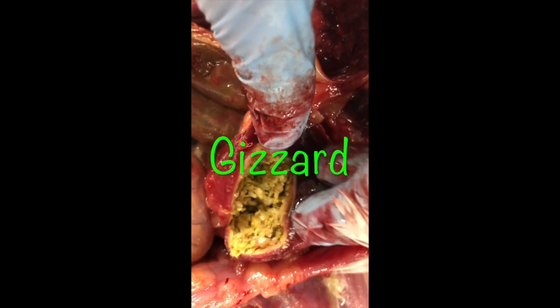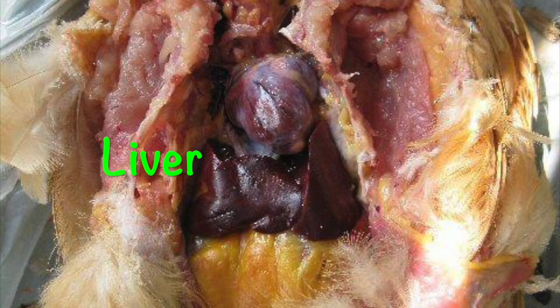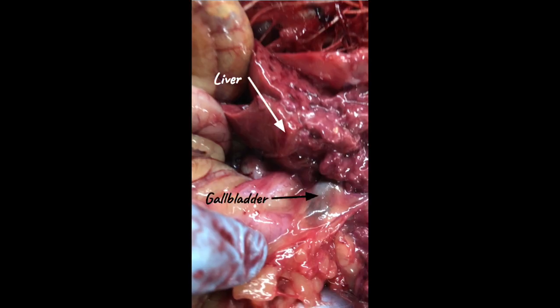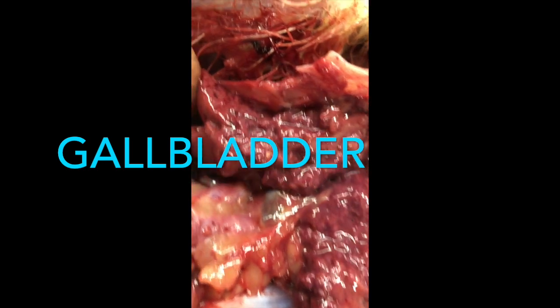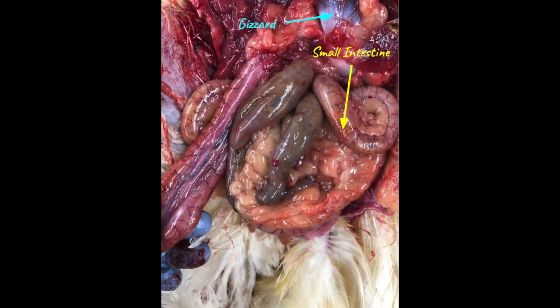The chemically digested food enters the gizzard — this is where all the mechanical digestion takes place. The gizzard has a thick muscular wall and four lobes. The liver processes nutrients absorbed from the small intestine and is a large gland that creates bile. The gallbladder stores bile and then releases it into the duodenum. The small intestine is where Helena absorbs most of her nutrients.